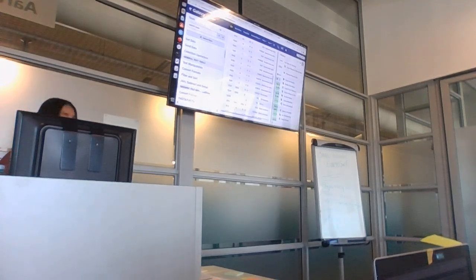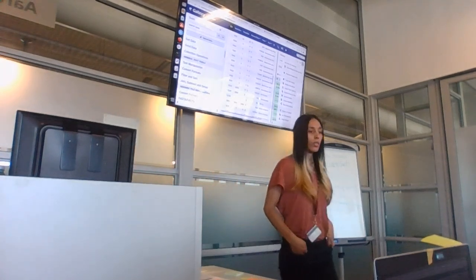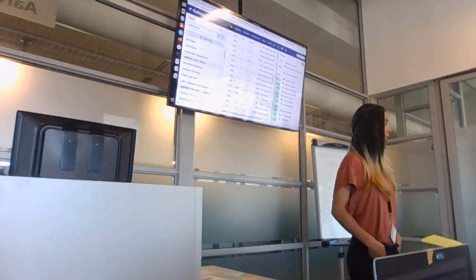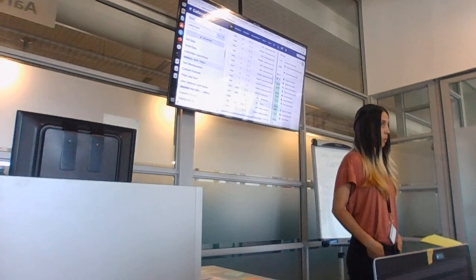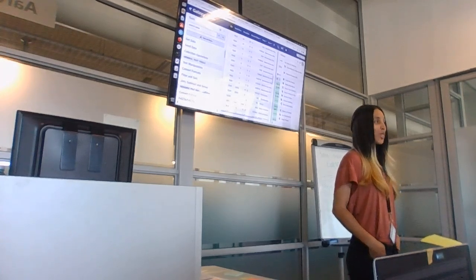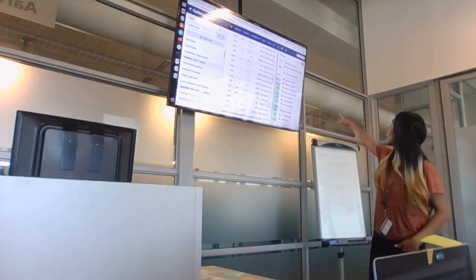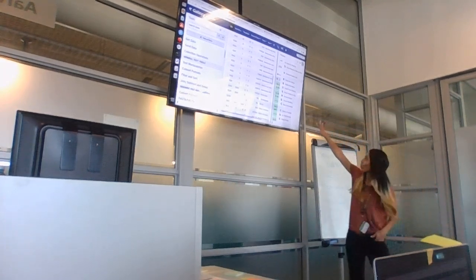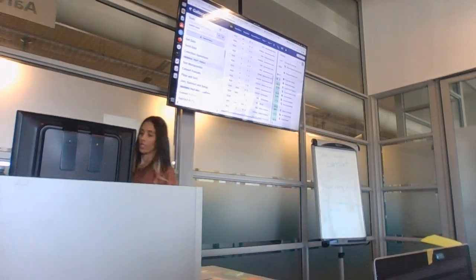Okay, so do you remember something called extract workflow? If you click on that drop down button, if you wanted to create a new workflow, could you find it there?